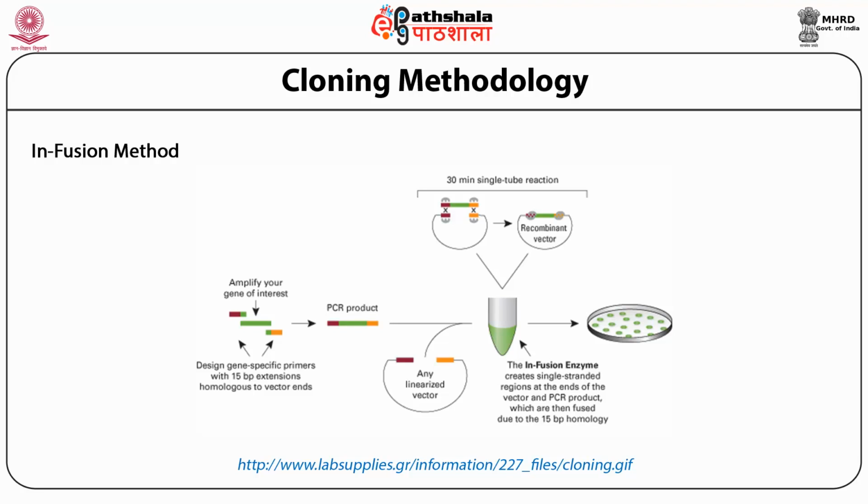Now what happens inside that Eppendorf tube is that once you incubate these, because these primers or these overhangs are homologous or similar to each other, a recombination happens. Now in this linearized plasmid or linearized vector, we will have our gene of interest cloned in it, as shown in this picture.